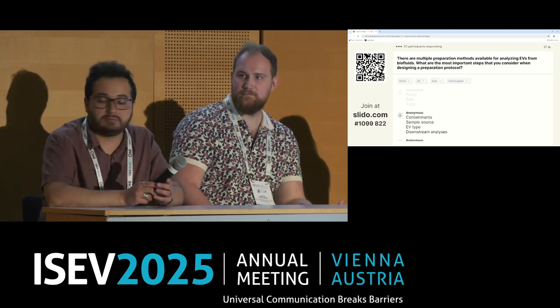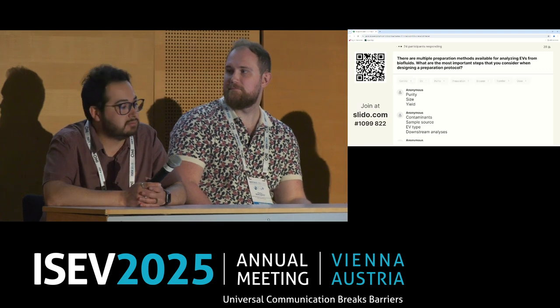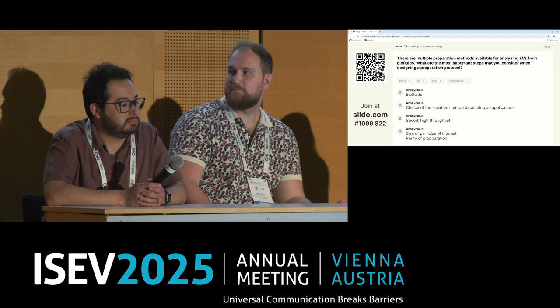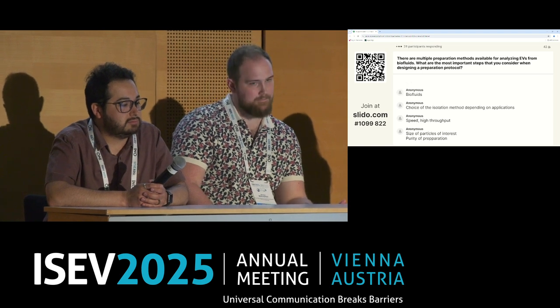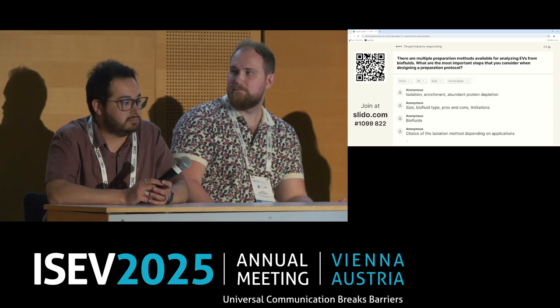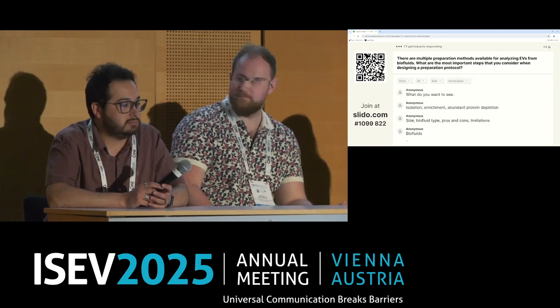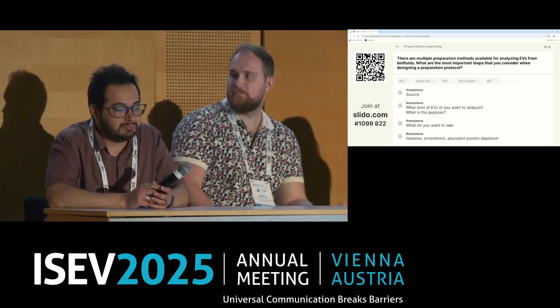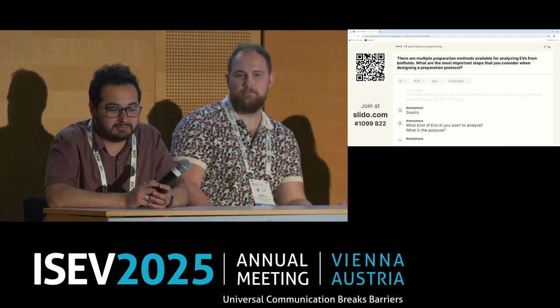Okay, I think we see many of the comments that were touched upon also coming back in the survey. Speed and high throughput is a particular one that we did not really go into detail on, but from the current experience, the faster and the more high throughput, the more difficult it also is to have a higher level of specificity.